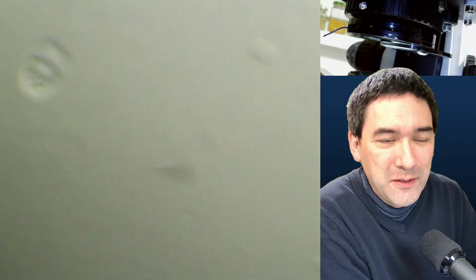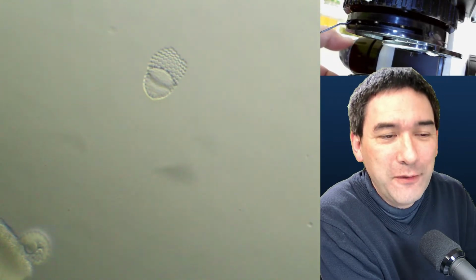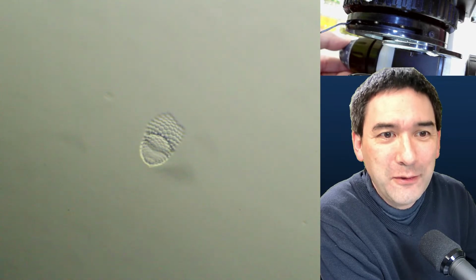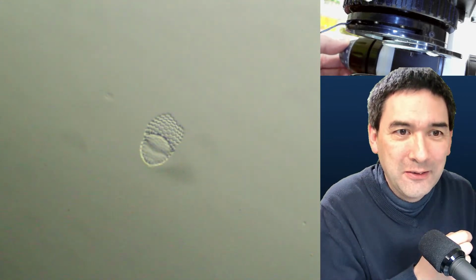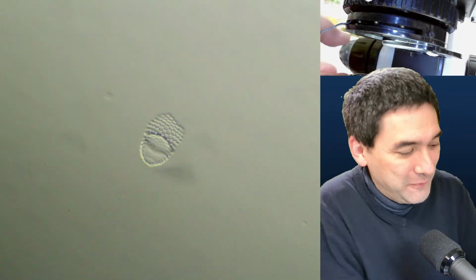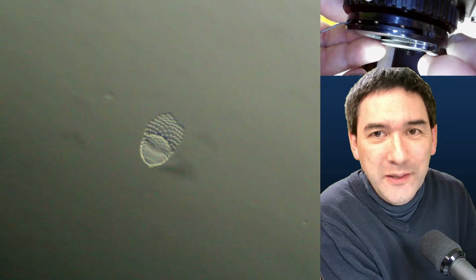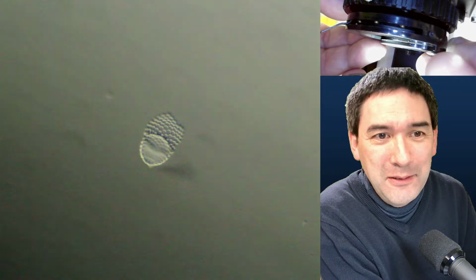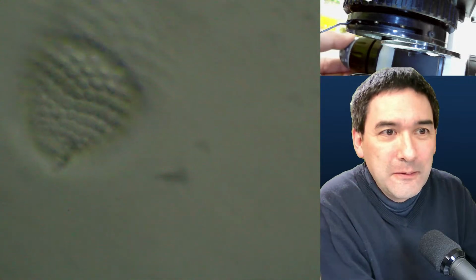Need to tune it down a little bit. See, actually that's quite a nice one here, and I'm not using any filter right now at all. It's just a completely empty filter holder, with the borders, the edges, so to say, now in the light path. And look, this actually gives you a 3-dimensional view as well. It's kind of ironic. I spent so much time figuring out the correct size of the filter, and then all you do is just put the empty one in here, and you also get a view. I have never tried it with a 40x.